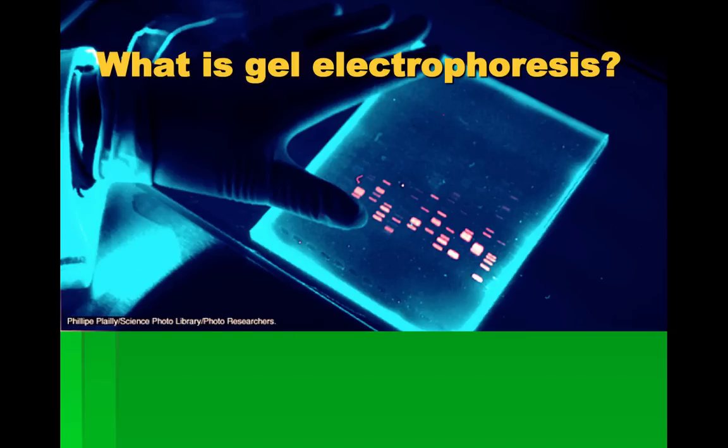Okay, so this is called gel electrophoresis. It's a very fun technique to do and to analyze as well. So what we're looking at here is a gel which has the consistency of, all I can think of is Japanese food. Something called konnyaku. It's kind of like a rubbery jello, kind of hard jello. So imagine hard jello, okay? And you touch this stuff and it's clear, you can see through it, and under the correct lighting, or UV light, particular bands can actually light up as if you've added something that makes it glow under UV light.